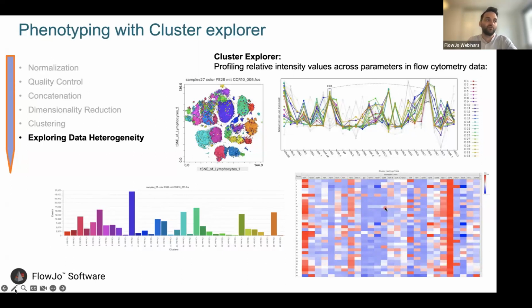And finally, we also have a heat map view, where again we see the different clusters and the expression of the parameters we selected. So it's a very helpful tool to identify and profile your clusters.